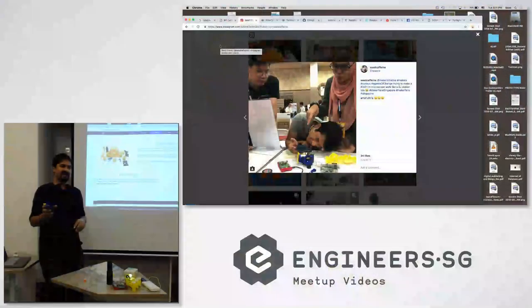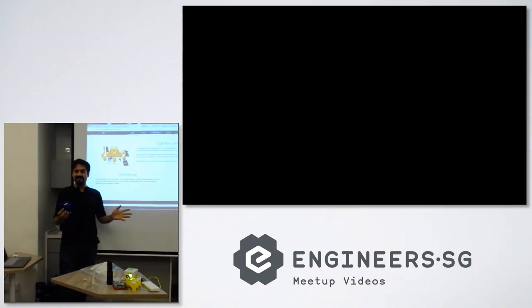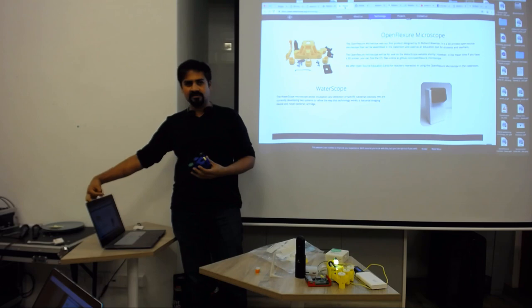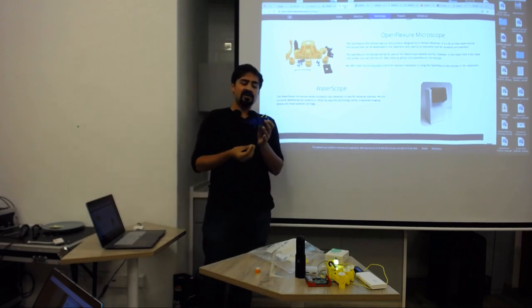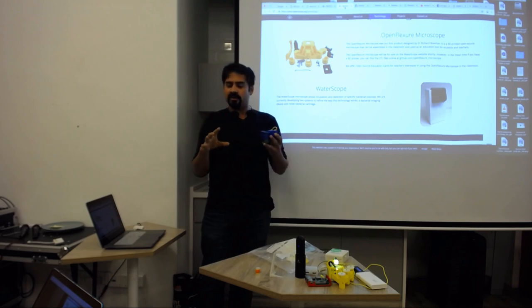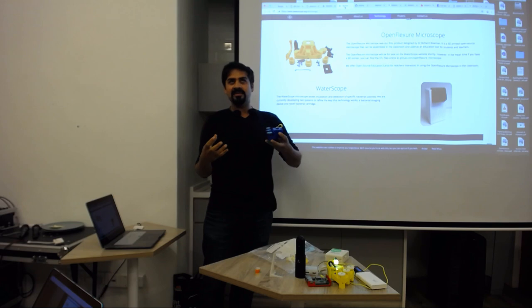They did exactly what I did, is they went online, they found a microscope design, which has been there since before the Raspberry Pi was invented. And it was designed to use little webcams. You know those webcams that you stick on top of your monitor screen? It was designed to repurpose those. You'd stick a webcam in, and then you'd be able to focus on a specimen. You'd basically modify the lens. You'd reuse the lens. You'd be very hackery and cool about it. Take a $10 webcam and then turn it into something that was actually cool.